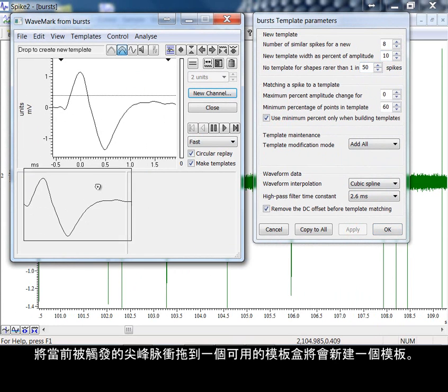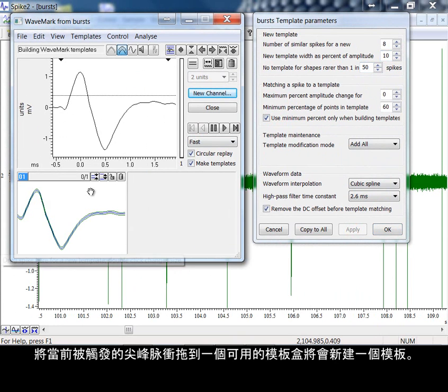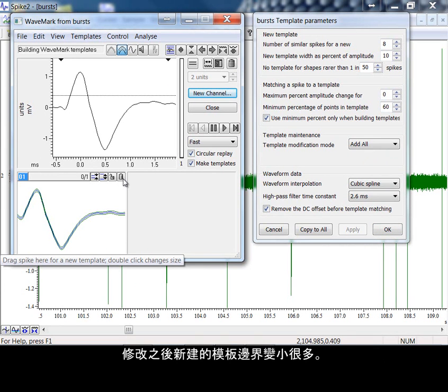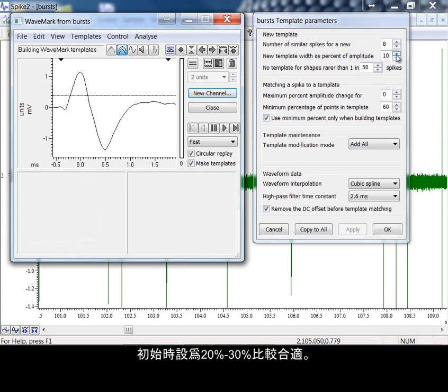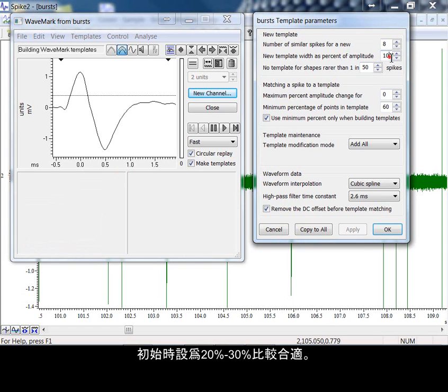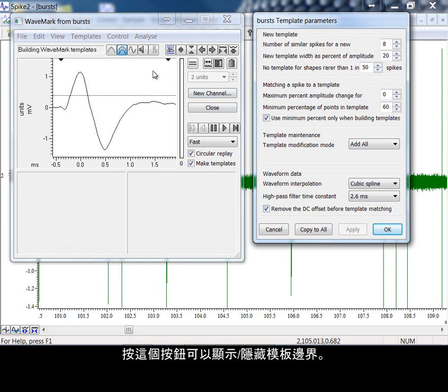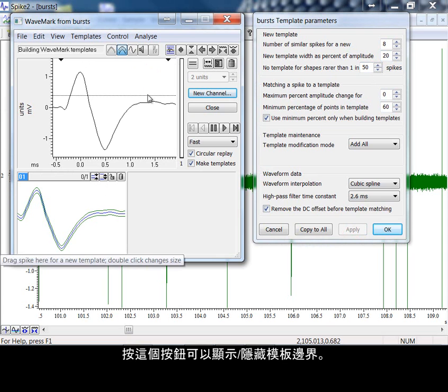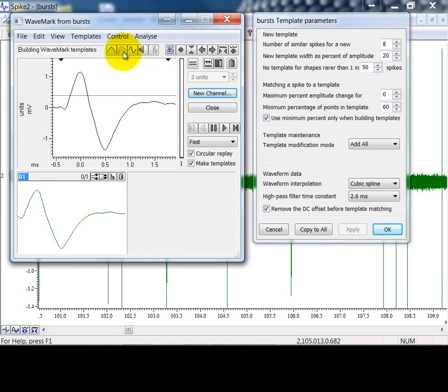Dragging the current triggered spike to one of the available template boxes creates a new template. The template limits are now much smaller after the change. Values of 20 to 30% should be a good starting point. To show and hide the template limits, we can press the button here.